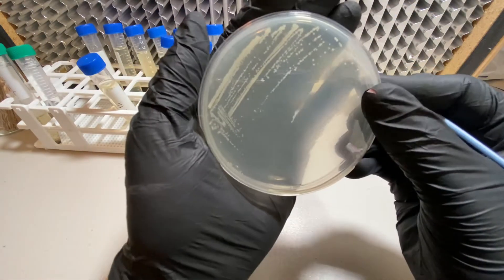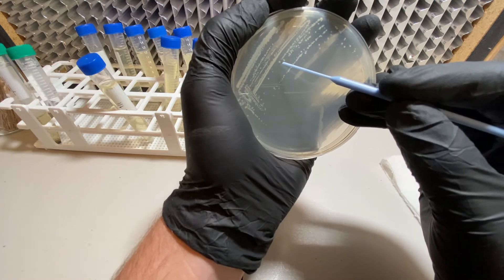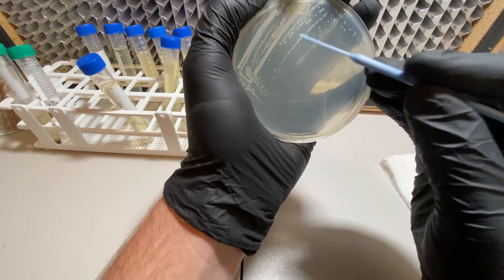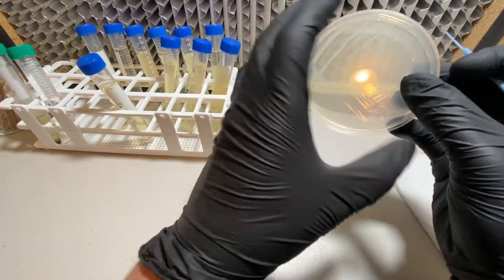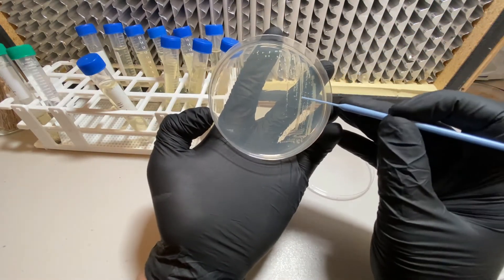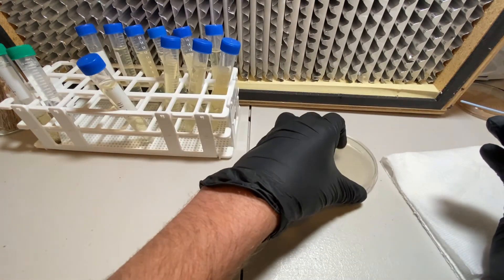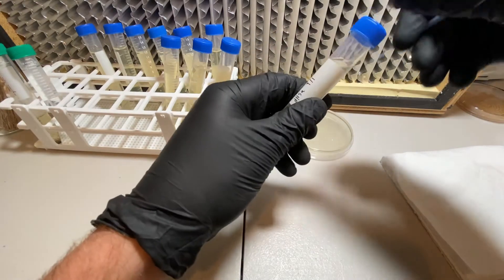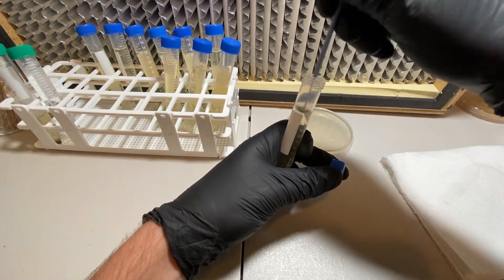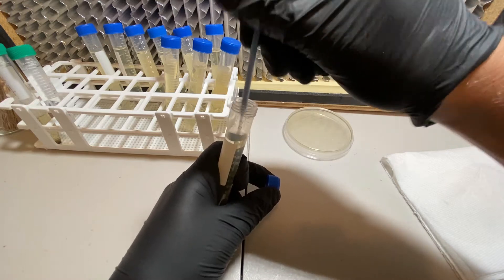We want to find one of these colonies — I try to find one that's already growing pretty well. There's one right here that's relatively big, and some over here we could use too. I'm going to try to use that one right there. I just lifted that colony up.